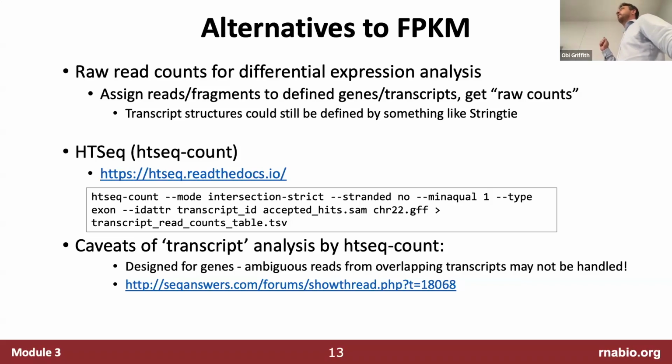So the more times reads are aligned to a gene, the more counts that gene gets, and that's used as a measure of expression. It's only useful together with some of the statistically robust downstream packages, of which there are several that we'll talk about.